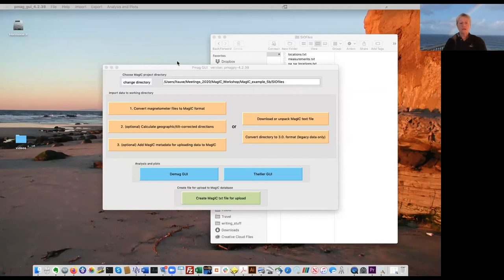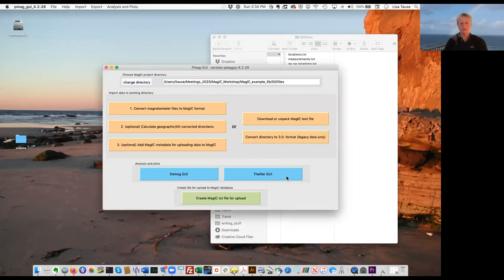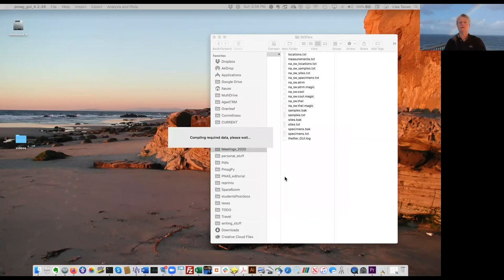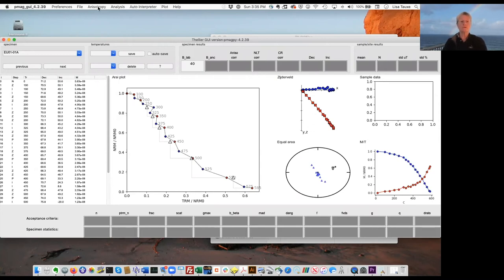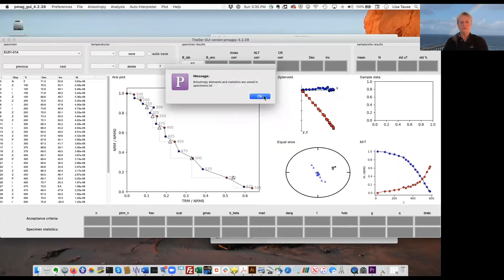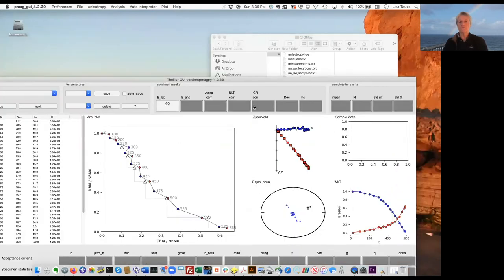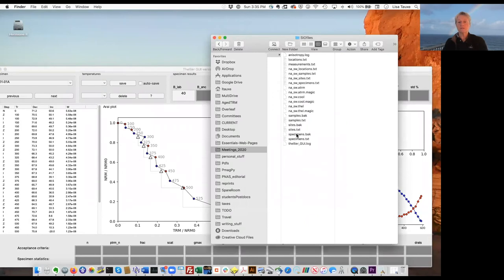Now we're ready to launch TellierGUI to look at these data. I click on TellierGUI and it loads the data file. This experiment included anisotropy information, but we have not yet calculated the tensors. So TellierGUI will do this for us — look under Anisotropy and Calculate Anisotropy Tensors. It calculated the tensors and put them in the specimens table.